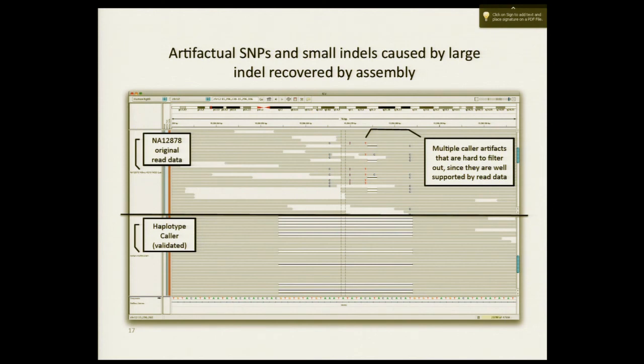And you can, of course, use the indel realigner if you wanted and say, give me these reads with this proposed indel and have the indel realigner realign it. And it will probably do it, but maybe not because this is too big for the indel realigner. So actually, the indel realigner probably won't do this particular example. So probably what I'll do soon is create a mode where you realign the reads to the potential alleles and output the BAM, because people seem to like this. It's sort of a way to validate the results. So OK, eventually I'll get that done. But right now what you get is a VCF file with a 20-some base pair deletion at this locus.